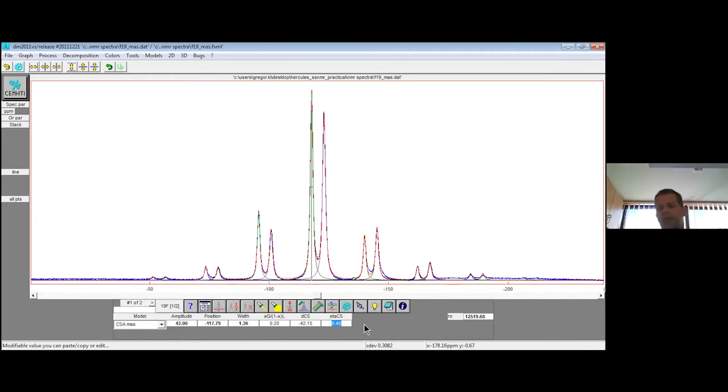But sometimes this determination of parameters is not good. Now we still have the calculated value as before, when we individually determined the sideband intensities. But if I use these parameters and calculate the spectrum, these parameters will indeed be used, and we can see that we still have quite good agreement. So these parameters were quite well determined from the spinning sideband intensities.